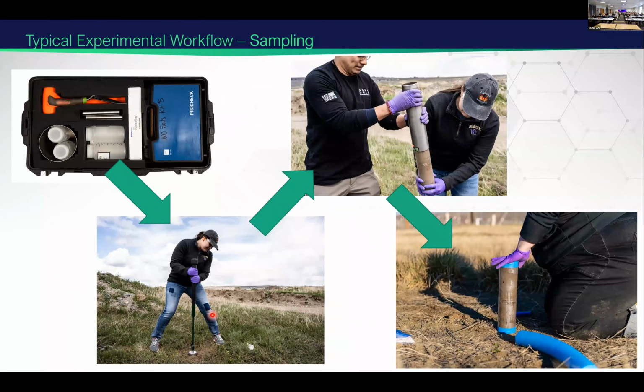So sampling, I don't think I need to tell anyone in the room how you go and sample a soil site, but you can find out more. MONet has developed these sampling kits. You'll go to the field, you'll get your core, and you'll put it in a little cylinder and send it to us. I won't go beyond that.